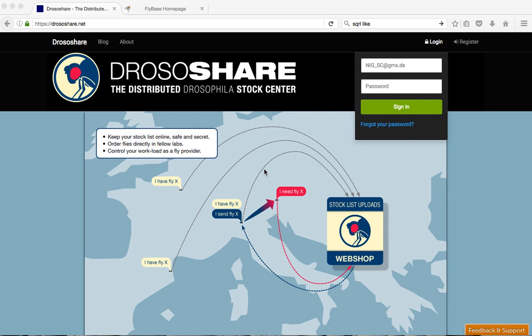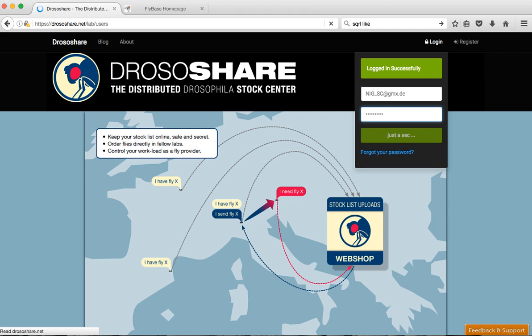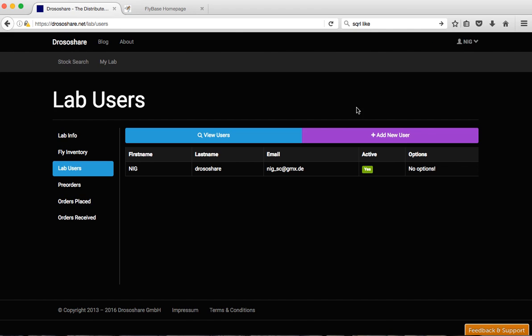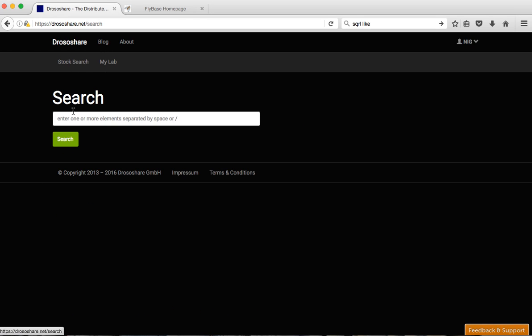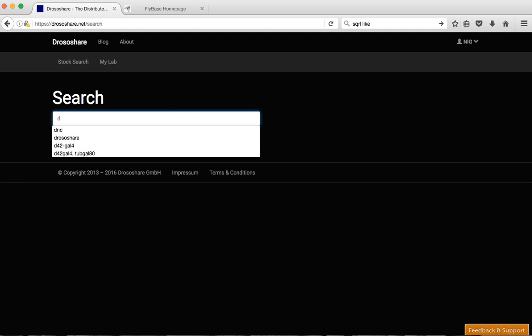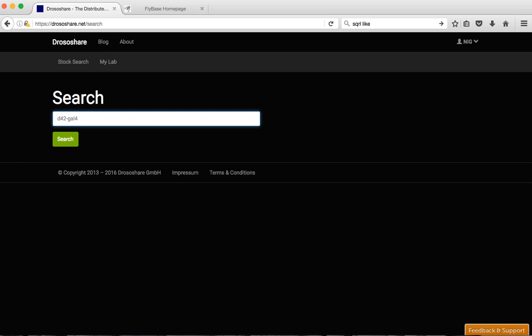Welcome to Drososhare and to this small video which will go through the stock search. First thing you have to do is log in to the system and you would go to this page. You just click stock search and we'll look here for a line which would have D42-Gal4 and UAS-PKCi.